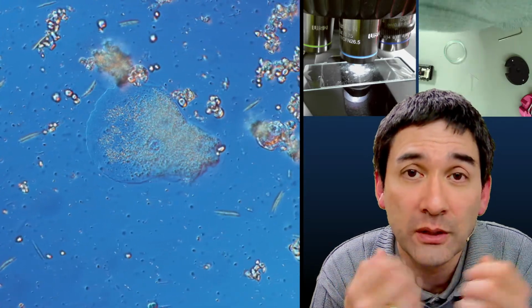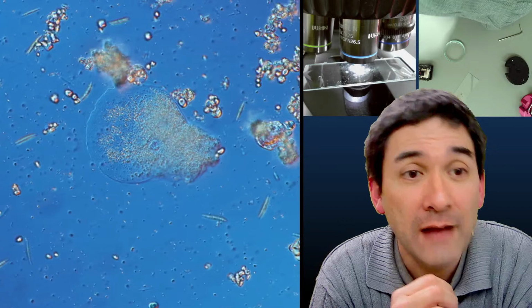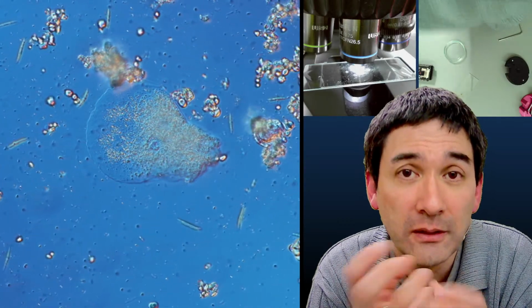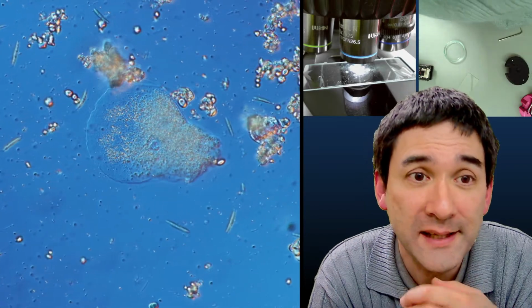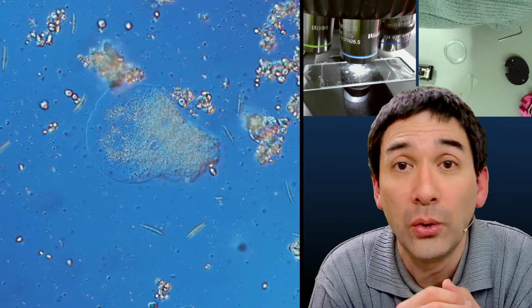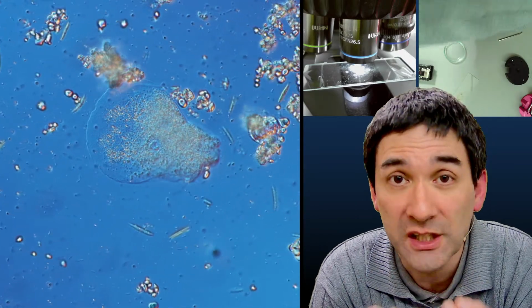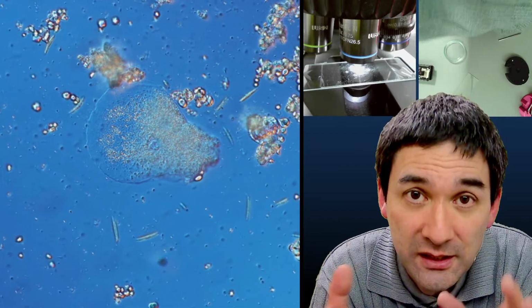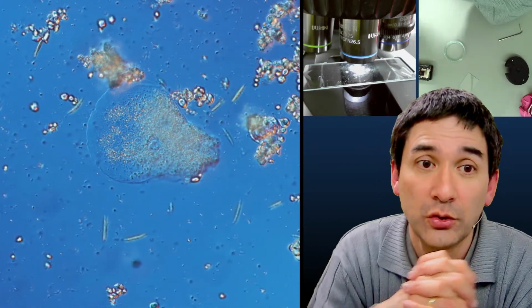And you can try to concentrate it like this. I've not tried this yet myself, and I think the challenge would be how can you concentrate those microplastics, and maybe you're also able to identify other things in the snow, like certain dust particles, maybe pollen, and so on. But I think the challenge is again on concentrating it.